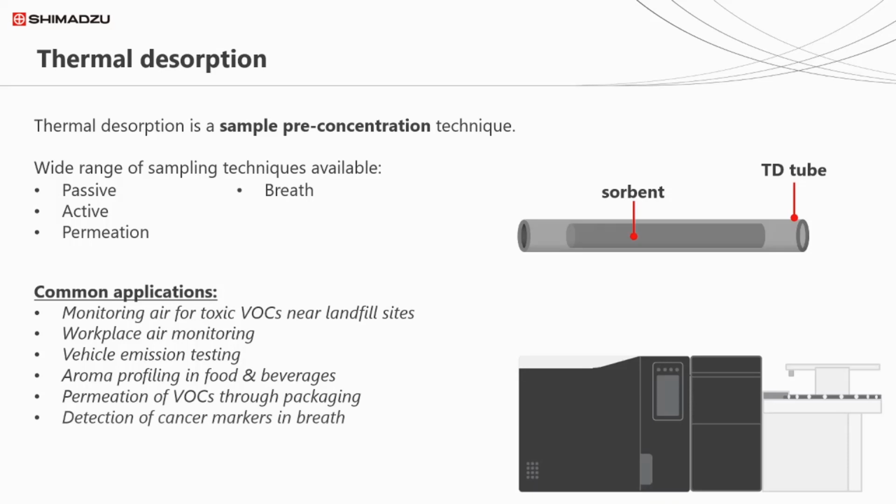Samples can also be taken from breath. Devices are commercially available that enable you to breathe into a mask containing TD tubes. These tubes can then be analysed for specific biomarkers that may be linked with cancer.